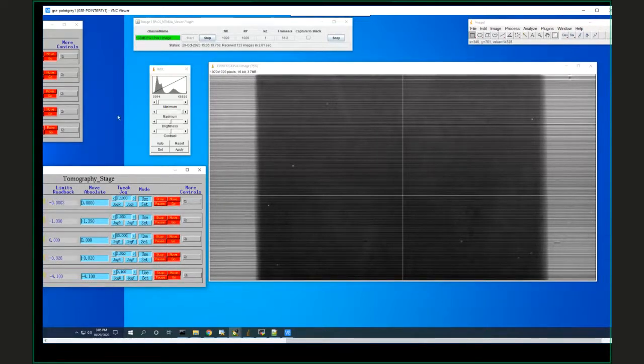This camera is 1920 by 1200 pixels. But right now, the beam isn't quite 1200 pixels tall because even though I'm defocusing with the mirror, it's not quite as big as that. Right now I'm using the Nikon macro lens, with no tube on it and with the minimum focus adjustment on the lens. At that point, it is truly a one-to-one imager. The pixels in the CMOS camera are 5.74 microns, and the pixels in the image now are also exactly 5.74 microns.